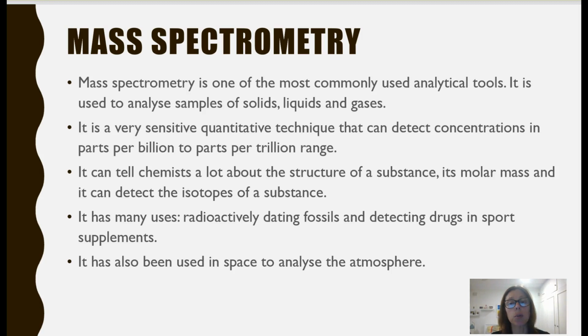Now, it is one of the most commonly used tools that we have, and it can be used to measure or analyze samples of solids, liquids, or gases. So it's quite handy, and it's quite a sensitive technique that we have, and it can really measure some concentrations as low as parts per trillion. So we've talked about parts per million earlier in this, or in our last unit when we were talking about polymers.